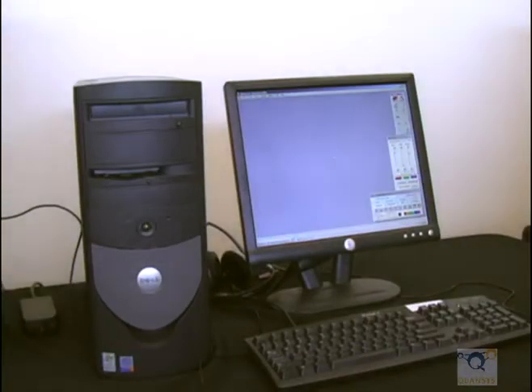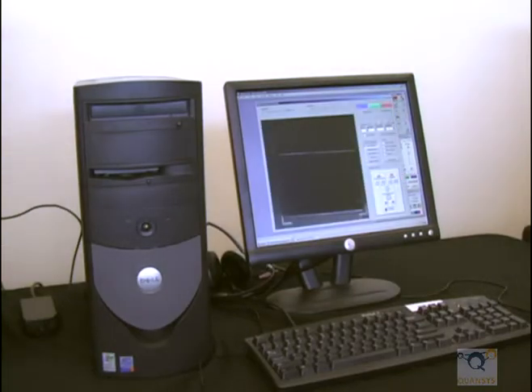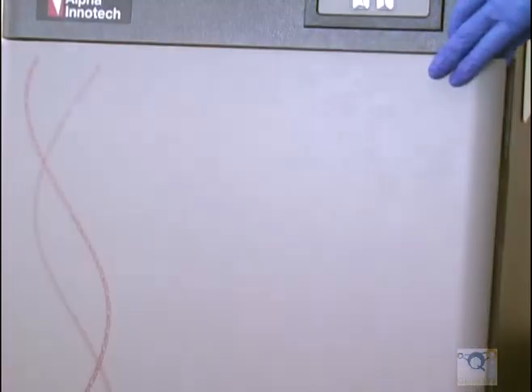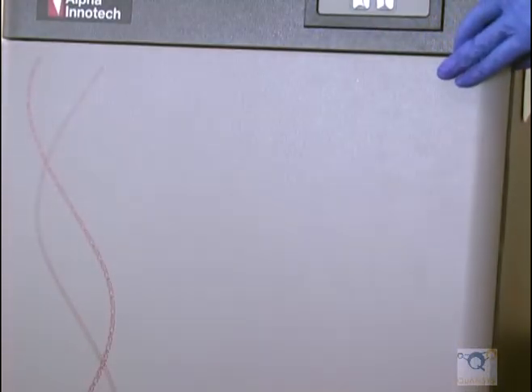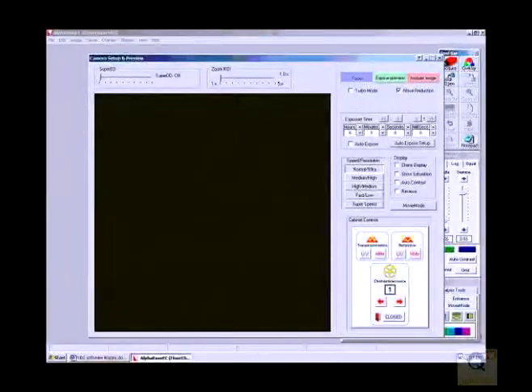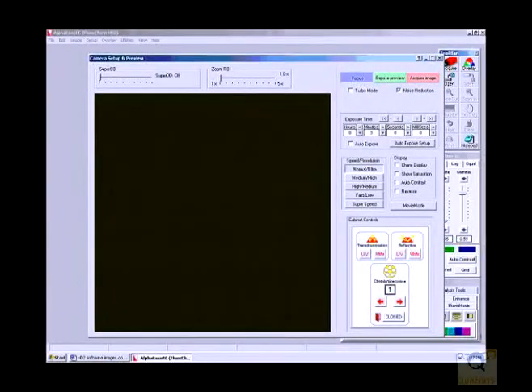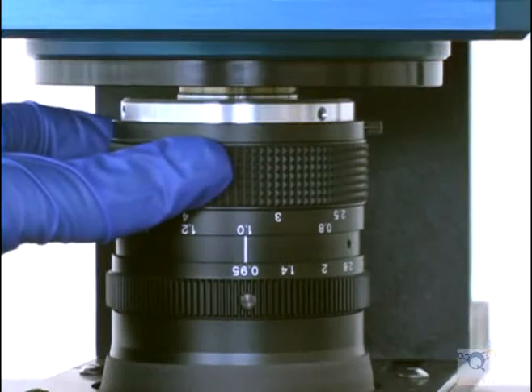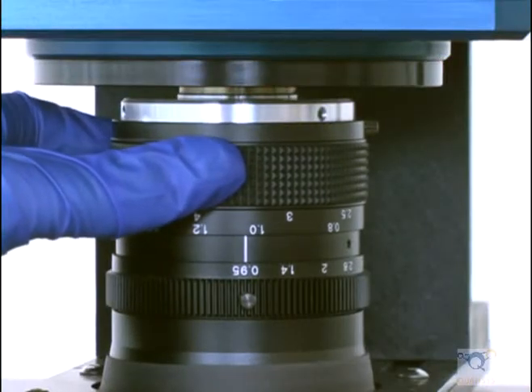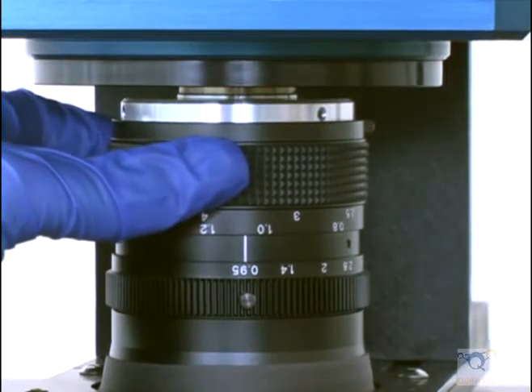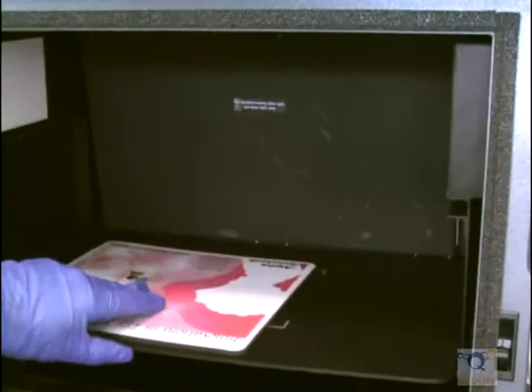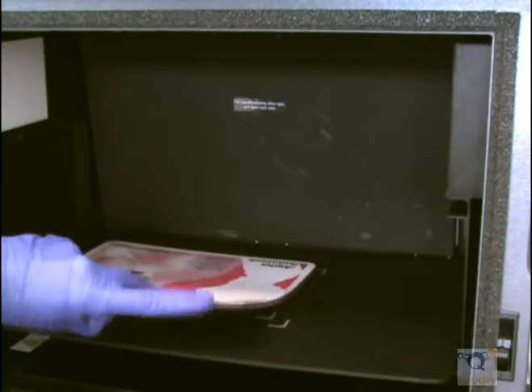Launch the software on the computer, then click the Acquire button. Close the door on the camera slightly so some light can get in and you can see the mouse pad on the computer screen. Adjust the focus on the actual camera lens until the letters on the mouse pad are in focus. Then remove the mouse pad.